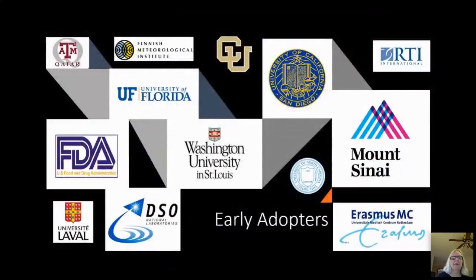Some of our early adopters were looking at disease transmission routes and sampling pathogens in environments as diverse as swine barns and a hospital operating suite. And most of these users are now sampling SARS-CoV-2 in a variety of settings. We're still waiting to see some of the publications, as many of these projects just got started recently.